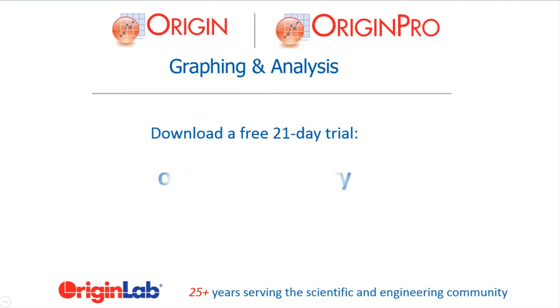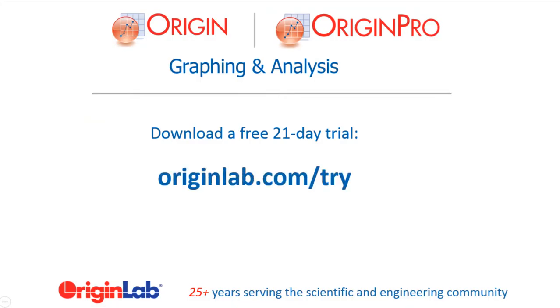Download a fully functional trial of Origin today and see for yourself how our user-friendly, yet powerful interface and tools can help you to visualize, explore, and analyze your data.